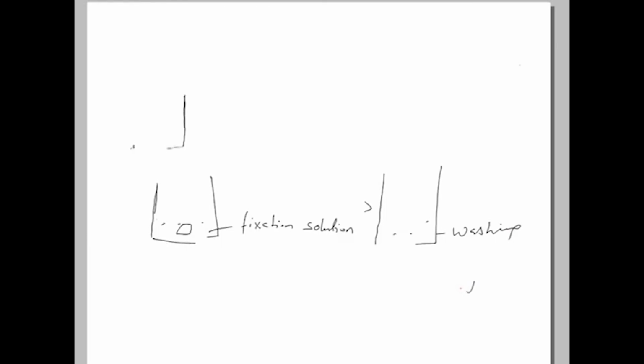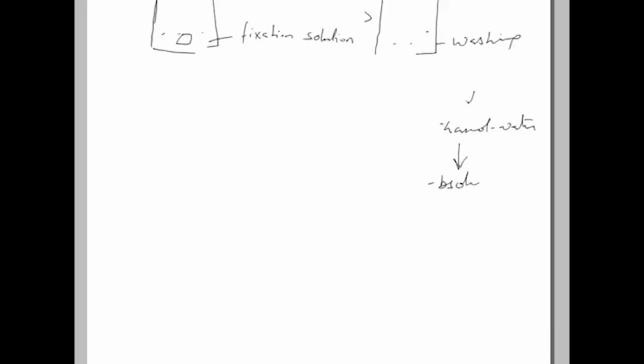So, a series of ethanol water and finally the absolute ethanol will be utilized, and then propylene oxide will be utilized as a transition solvent.